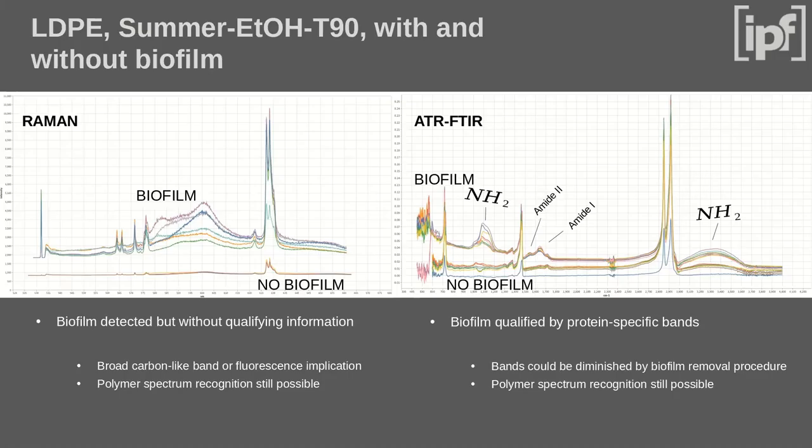And so in Raman, we see, okay, this is recognizable as an LDPE spectrum, even with the biofilm, but it has some extraneous bands in the middle, very broad, carbon-like, not really specific. This is not visible in the ones that were acquired afterwards, when the biofilm has been removed.